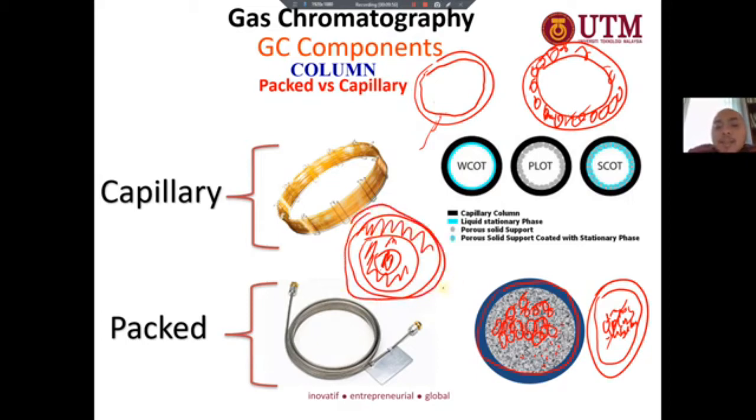So here is the wall, here is the fused silica, and here is the stationary phase, the liquid stationary phase, and also we have the open tubular over there.